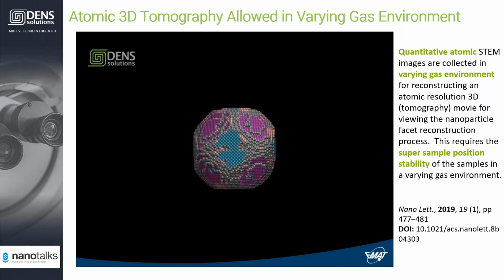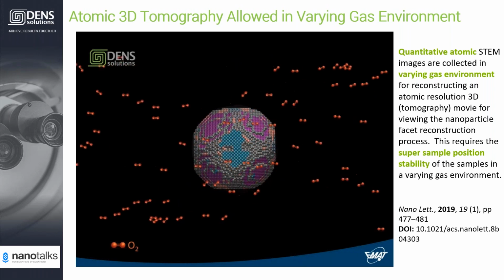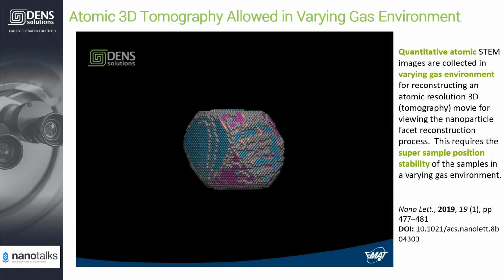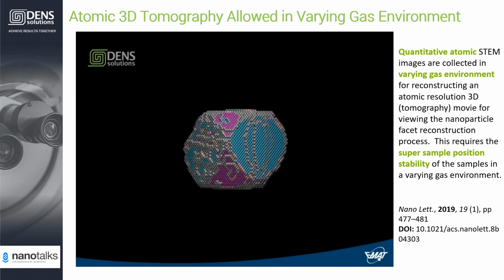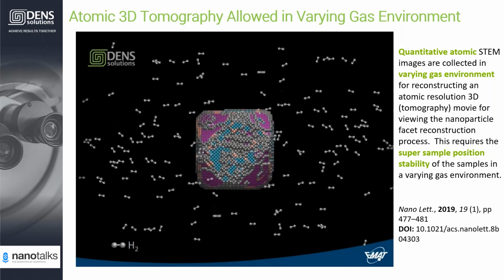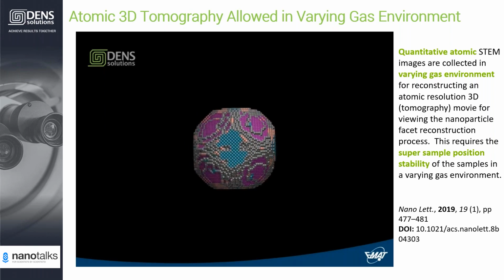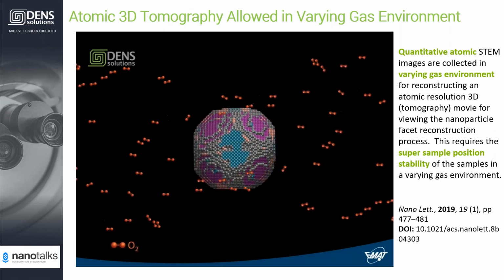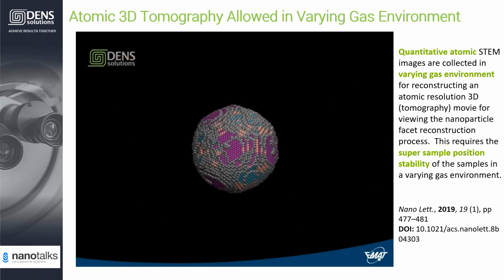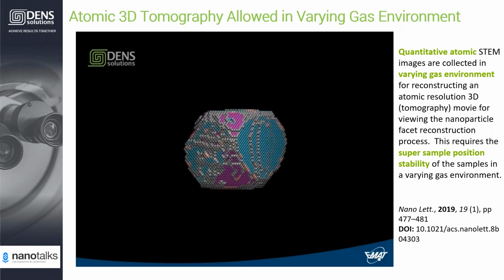And of course, one big advantage regarding the chips that we use is the fact that we're relying on metal, not on ceramics, and because I see that the question is also asking how you calibrate each individual nanoreactor: we don't need to work with individual calibration values, because we're working with metal that has a linear response and can withstand a very high current density.